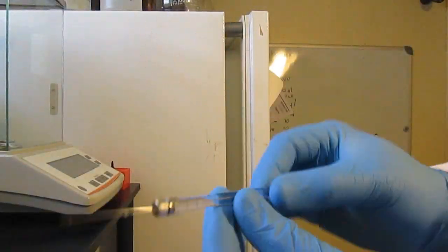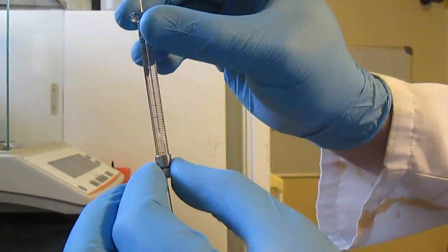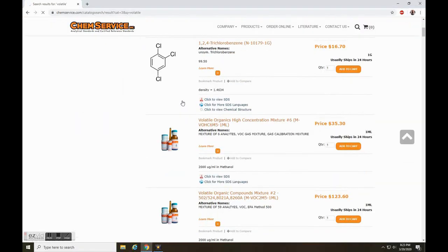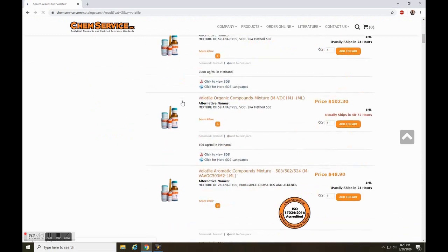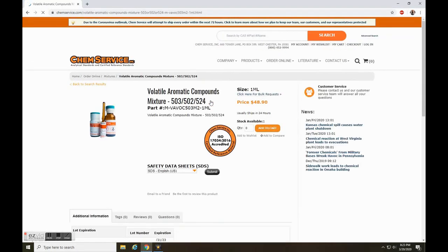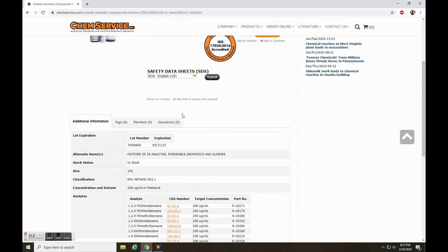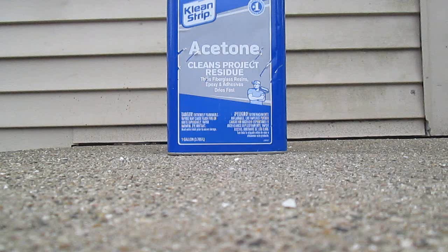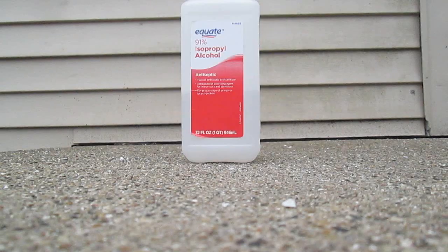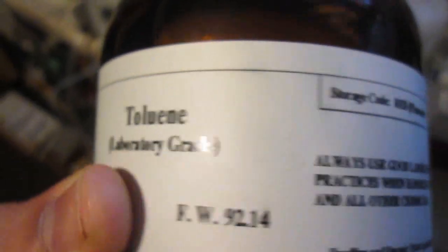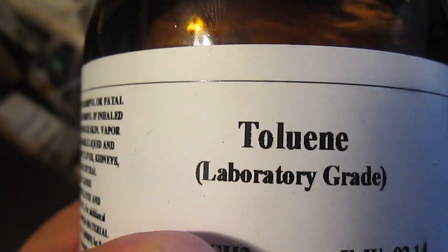Since I still can't find a standard for multiple compounds, I'll only be able to perform a qualitative analysis by measuring the retention time of different solvents under the same analytical conditions. I can quantify a few commercially available molecules.